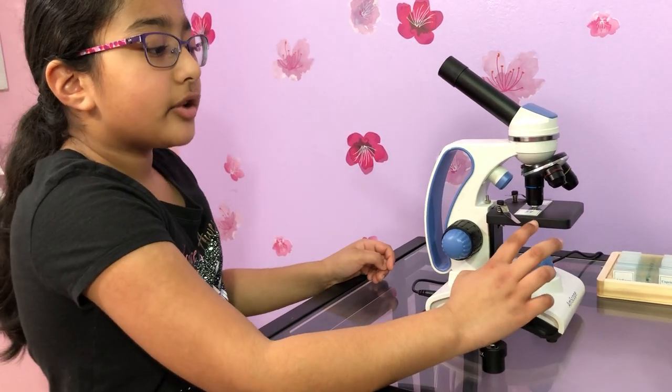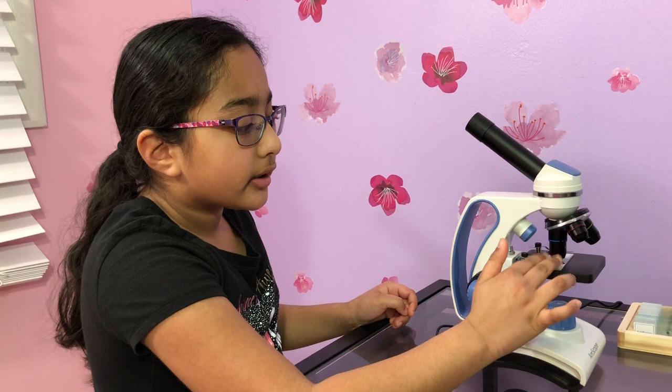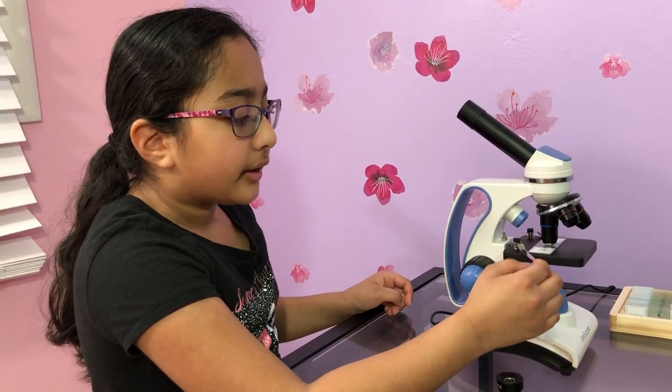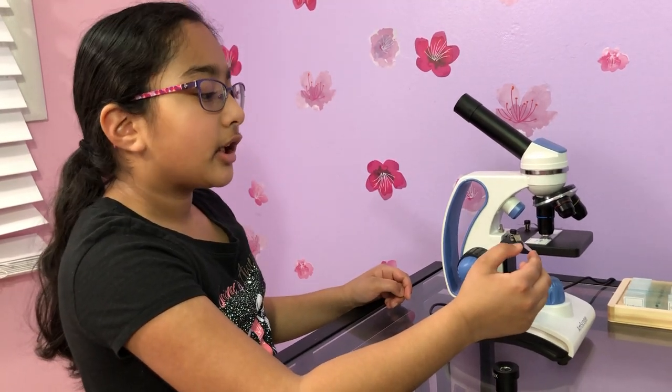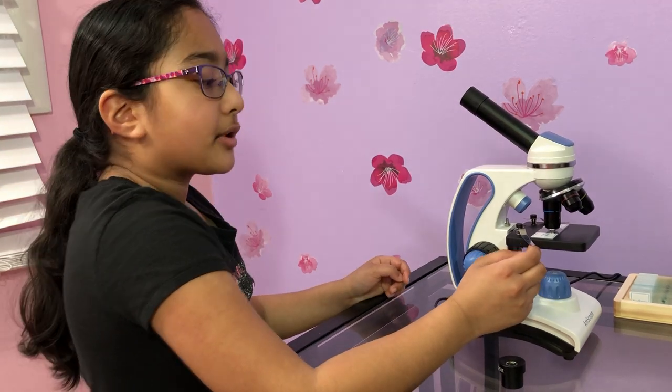Here is the stage where you put your slide on. You can see I already have a slide here, and there are clips to hold your slide on. This is optional, but I usually don't put the clips on.